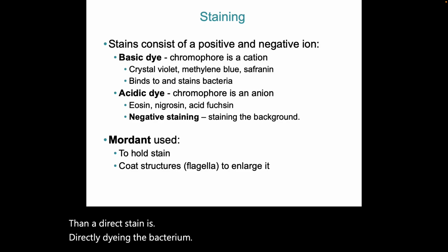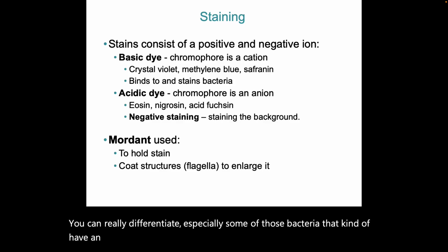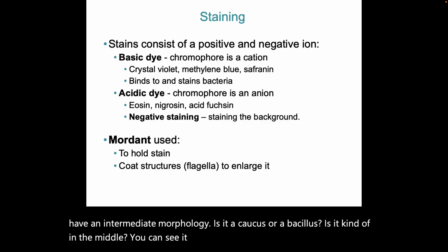You can really differentiate, especially some of those bacteria that kind of have an intermediate morphology. Is it a coccus or a bacillus? Is it kind of in the middle? You can see it really well with a properly done negative stain.